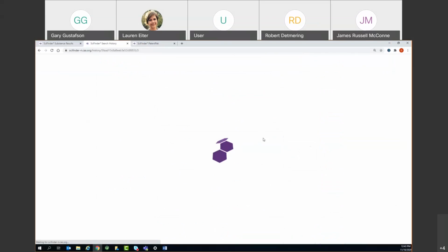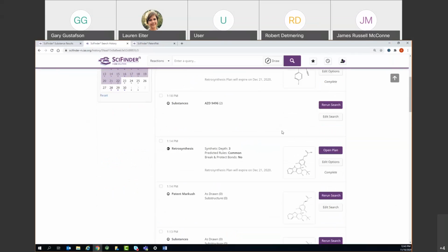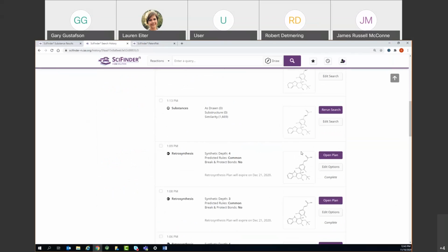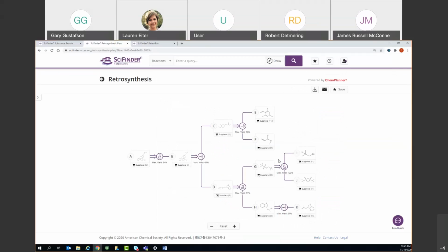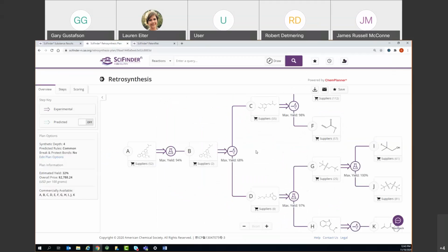I don't know why it dumped me onto the wrong date. Okay. So in this case, this is bringing back one time when I ran it and the predicted results finish.